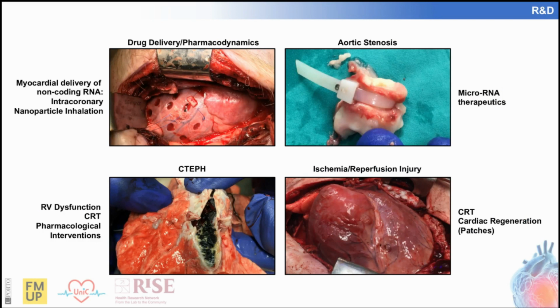In our experimental surgery lab, we focus on national and internationally funded research projects, and we also provide research services to the pharmaceutical and medical device industry. So far, all research performed at our large animal lab is related to cardiovascular diseases, and most of it ends up with the measurement of pressure volume loops.